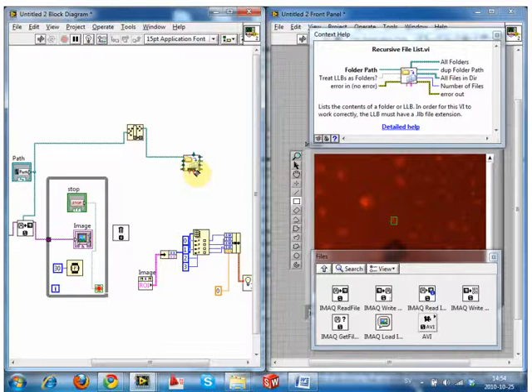So if we just ran all things, then we'd get kind of flashing colors as we analyzed it. But if we want to analyze just the green channel, we can say look at CH01, and then if it doesn't say that in the file name, it will never put it in the file list. And we can do it with folders too. We can set subfolders, and it'll actually do a lot more. For now, we're just going to read everything.